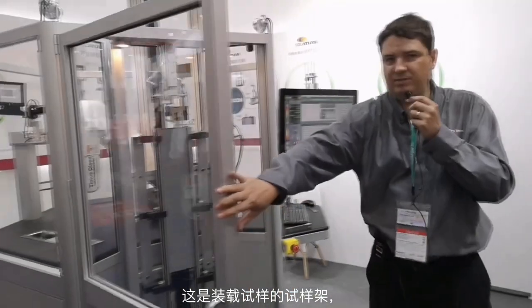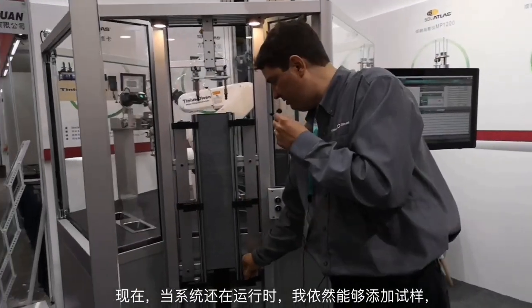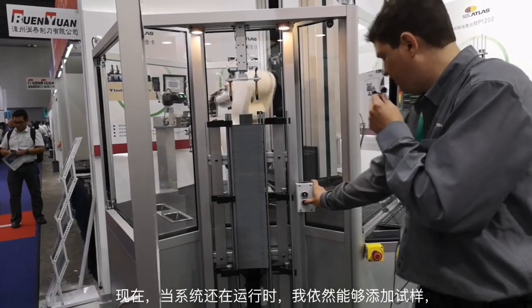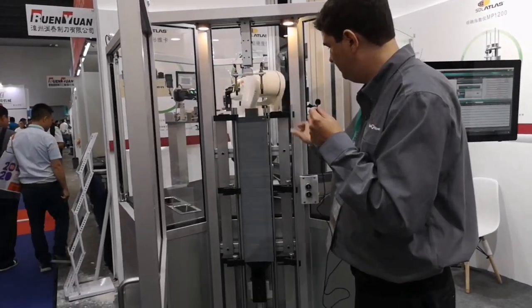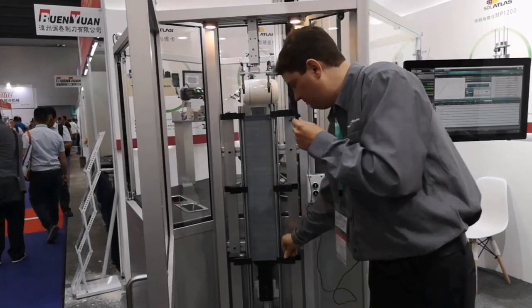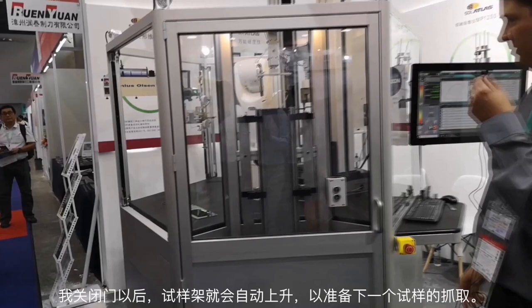This is the feeder system that holds all the samples. While the system is running, I can add some more samples. I'll close the door and it'll automatically raise up to get ready to pick up the next specimen.